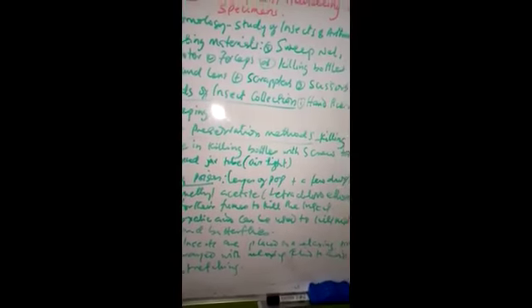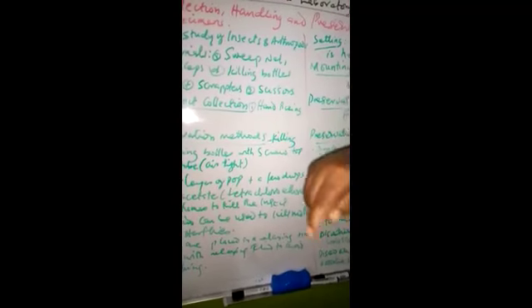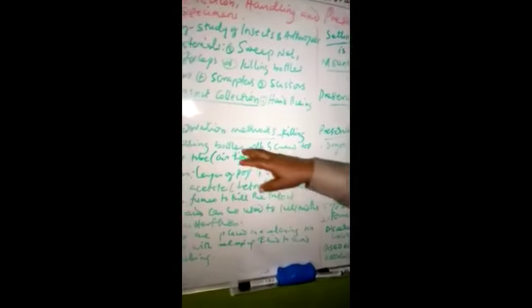Airtight. Airtight means that air will not be entering into it, because as long as air is entering, the insect will never what? Die. And once they are in this bottle, you just introduce a little poison and cover it. When they inhale the fume of that poison, the insect will die in a relaxed condition without struggling so that the structure will remain as it is.